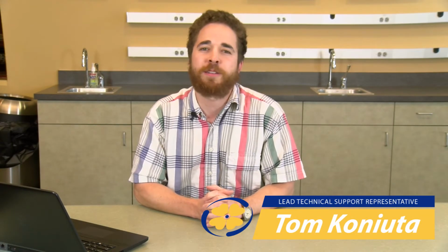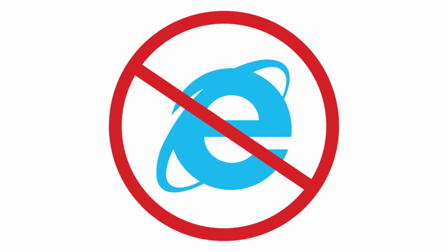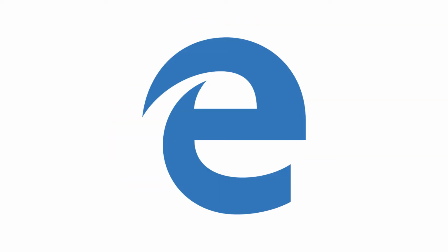Now that Matt has walked us through tube setup, I will take over for HydroVu Basics. Now let's dive into things. For starters, HydroVu is not compatible with Internet Explorer. Please make sure you have installed and are using Chrome, Firefox, Safari, or Edge on your personal computer.